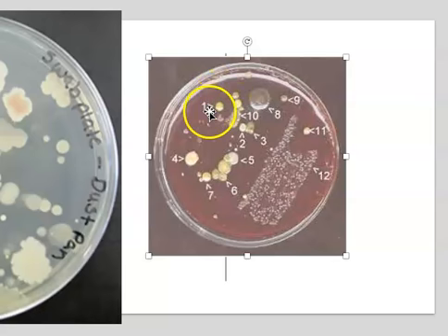They've identified this sort of mid-sized yellow colony as number 1, and then there's another mid-sized, more white colony labeled number 2, a very small colony 3, over here at 4, something larger, all the way up 5, 6, 7, 8, 9, 10, 11, 12. This tiny little white colony, there's lots and lots of them growing here, is number 12.